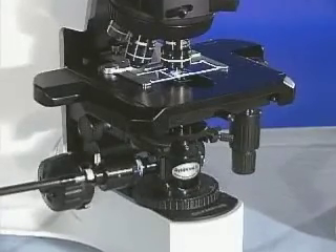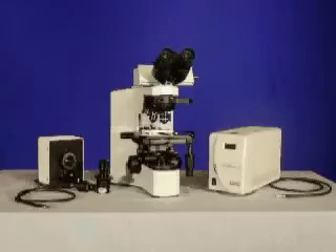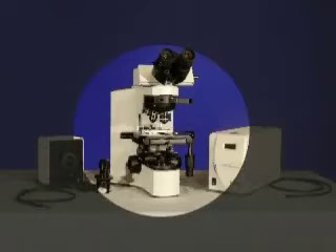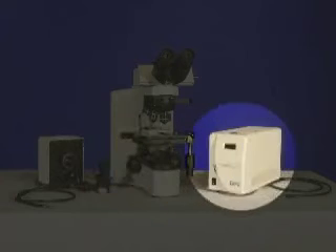To set up the CytoViva Fluorescence Imaging System, you will need the following: your microscope equipped with the CytoViva recommended emission filter, a CytoViva adapter, two light guides, a fluorescence modulation unit, and the light source.